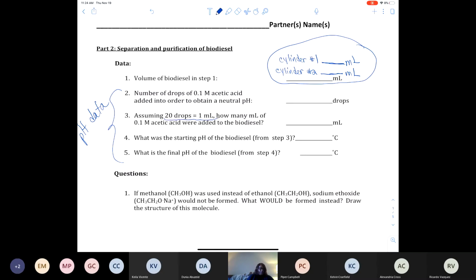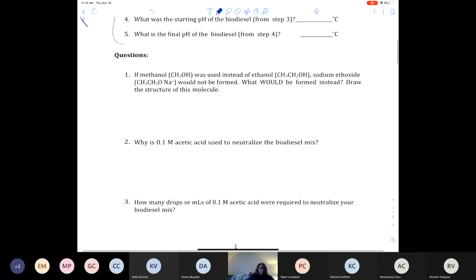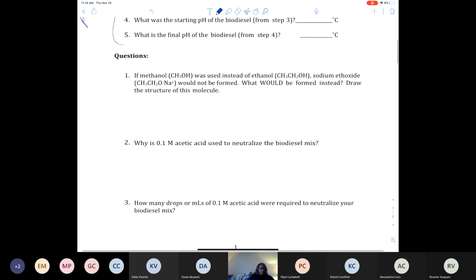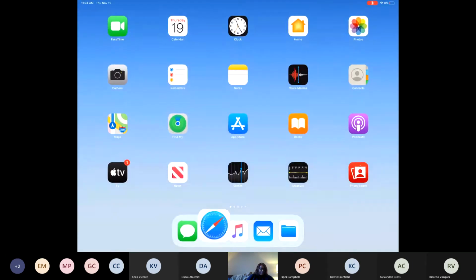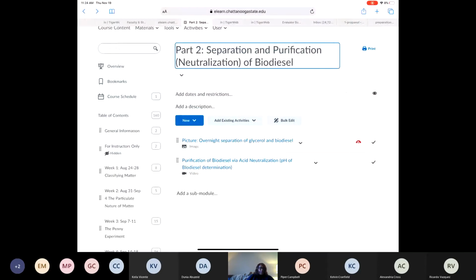And then from the video, you'll get the starting pH and the final pH. And then there are a few questions for you to answer based on the information you saw in the first two synthesis of biodiesel videos, as well as the separation and purification of biodiesel picture and video.